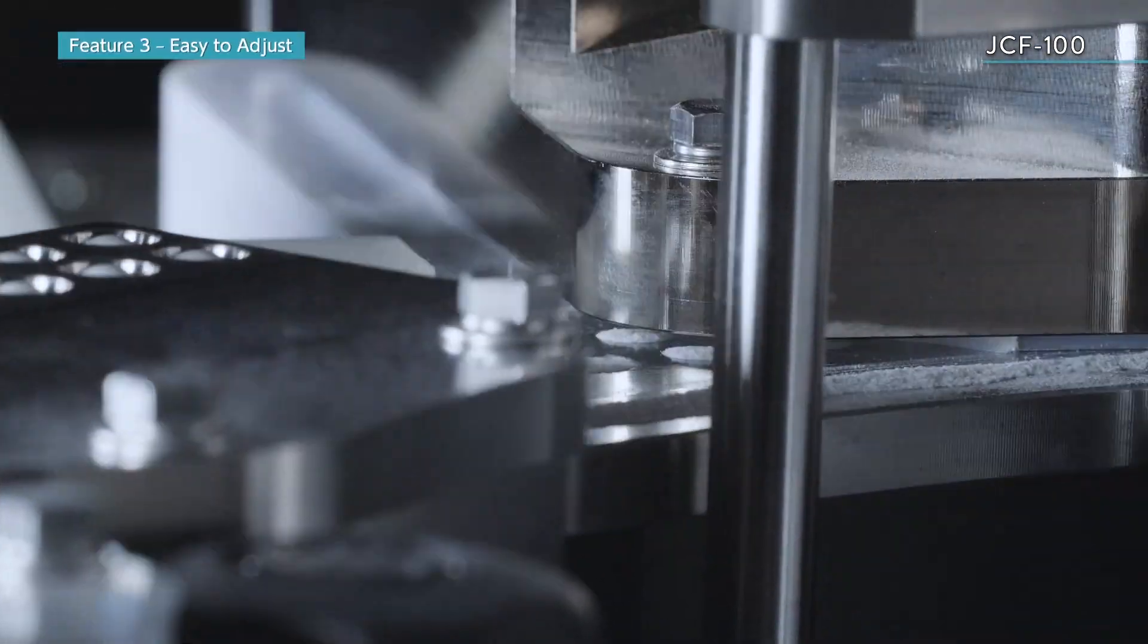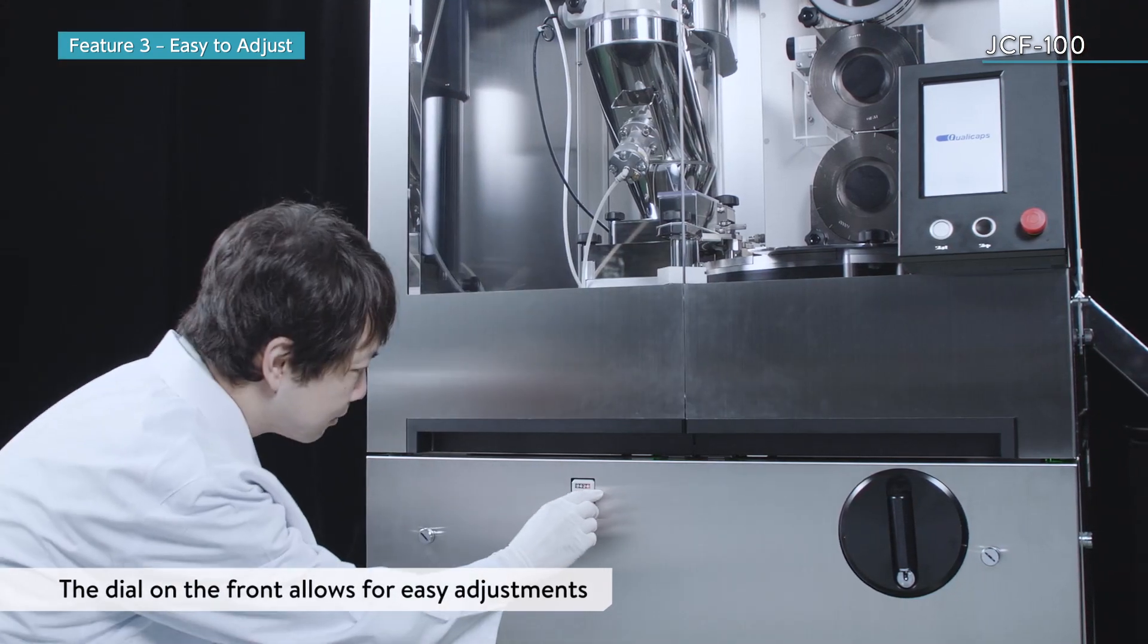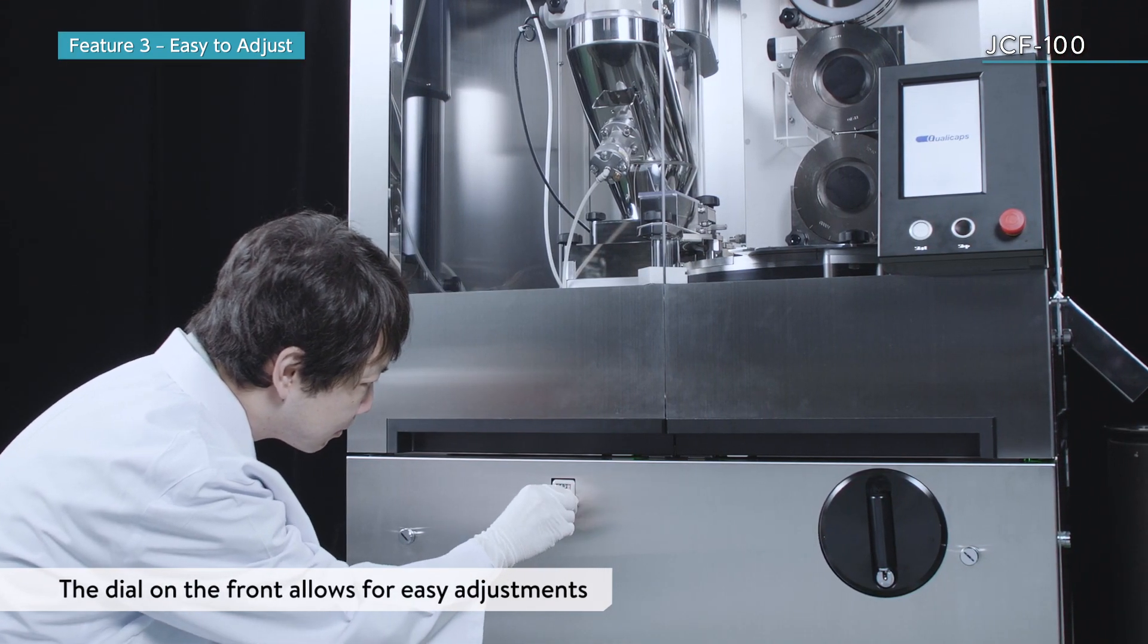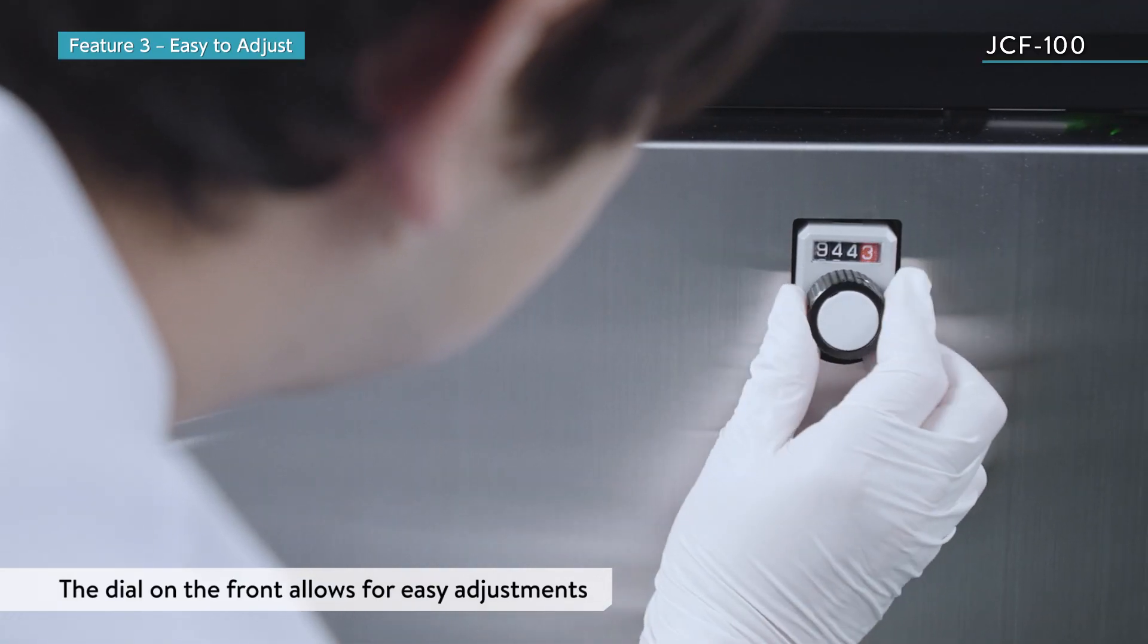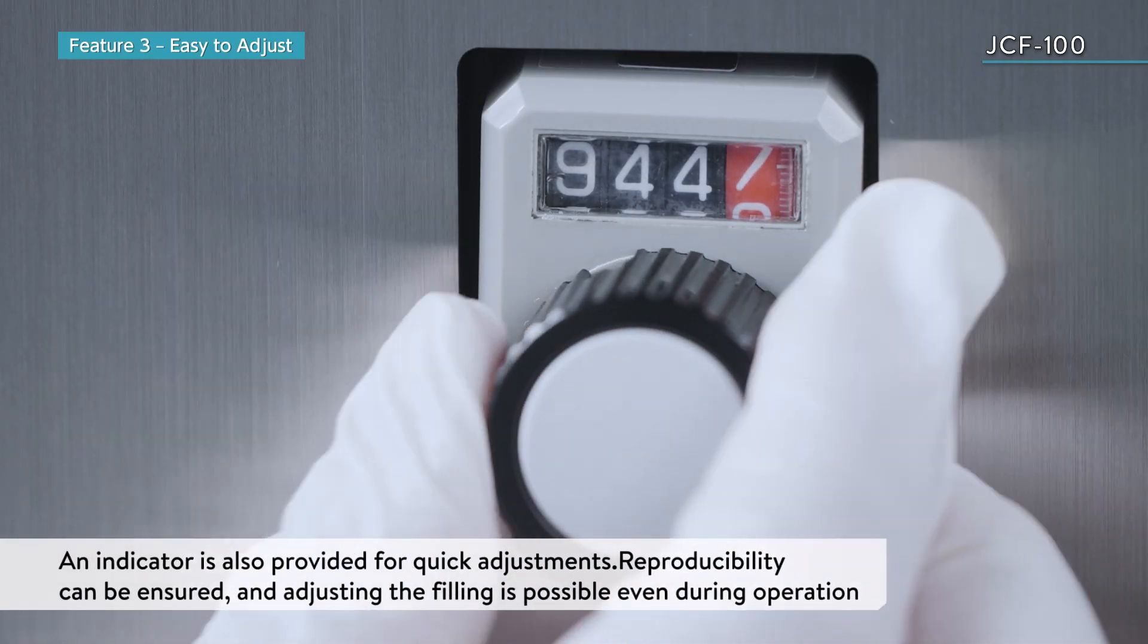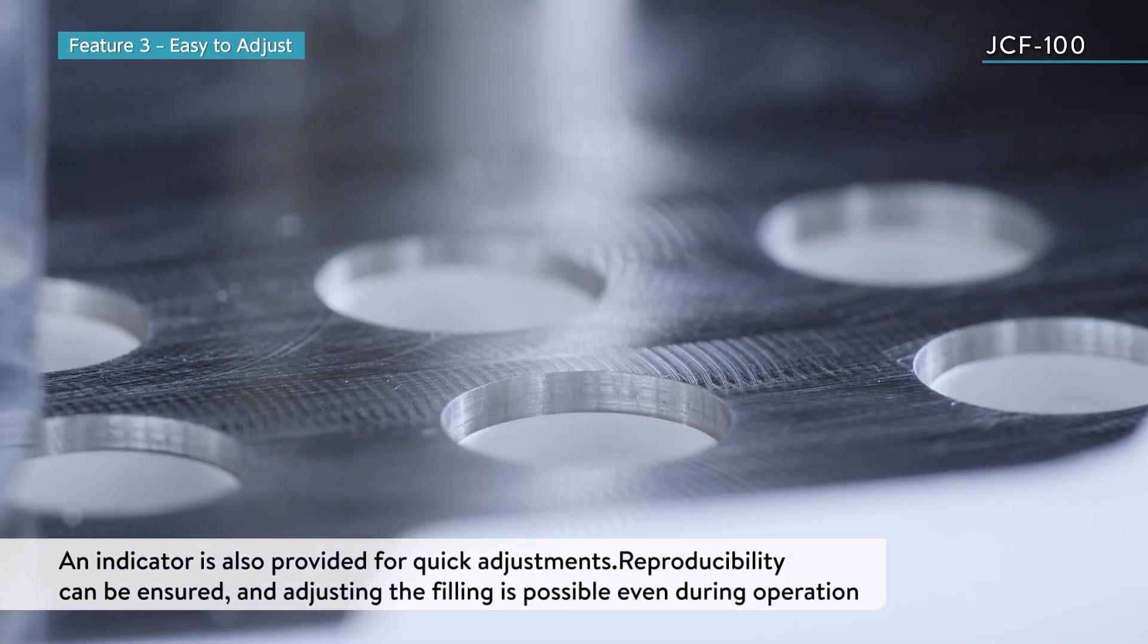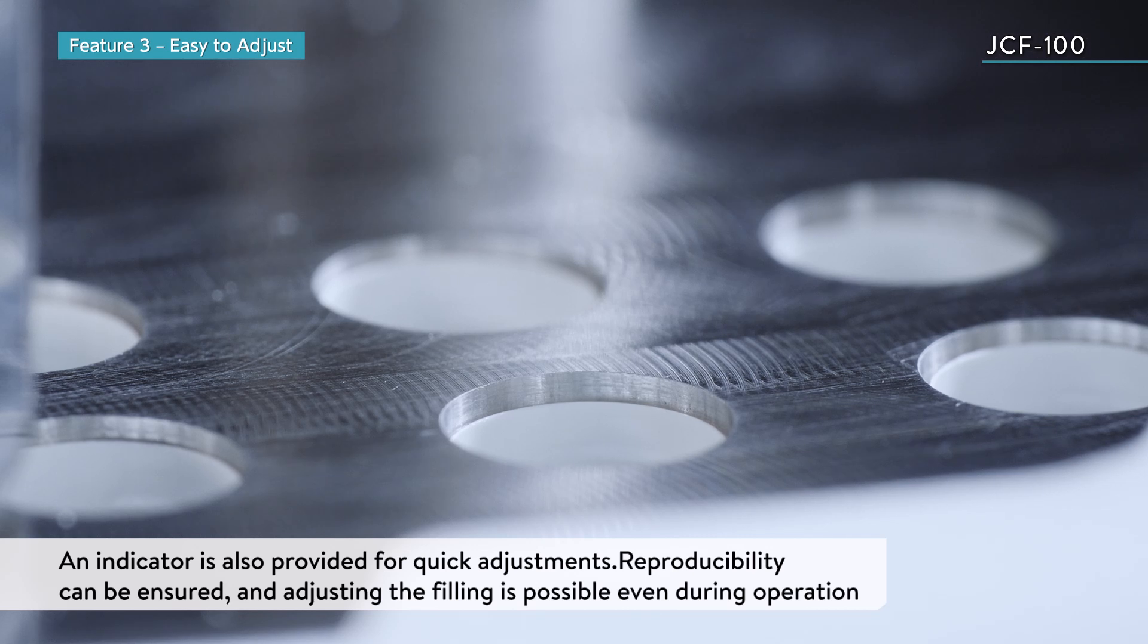The dial on the front of the JCF-100 allows the fill volume to be easily adjusted, which is the most important factor in capsule filling. An indicator is also provided for quick adjustments and to ensure reproducibility. Adjusting the filling is possible even during operation.